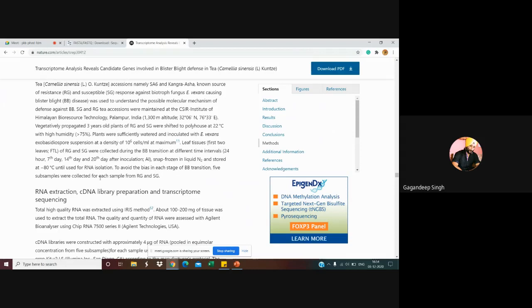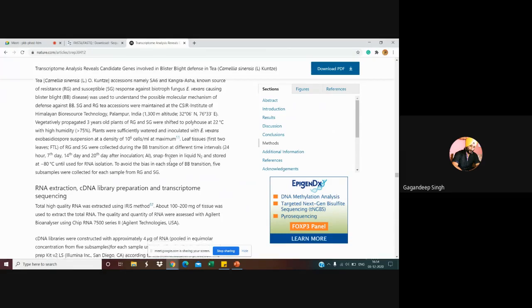Basically, we have selected two plants, extracted their data in the wet lab, and provided that data to the sequencing technology, Illumina. They generated data in the format of FASTA and gave that data back to us, and we have analyzed the data in the steps below. This is basically the wet lab step.